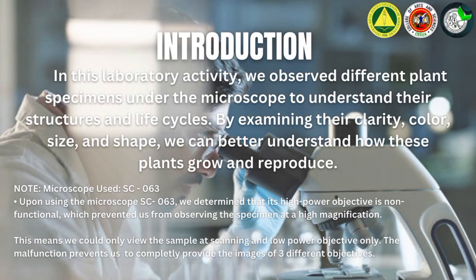Introduction. In this laboratory activity, we observe different plant specimens under the microscope to understand their structures and life cycles by examining their clarity, color, size, and shape. We can better understand how these plants grow and reproduce.